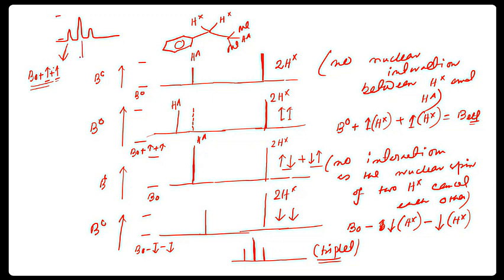And the second one is only for B0, as the nearby two proton nuclear magnetic fields cancel each other. So basically it's the same splitting as B0. And this one arises from B0 minus 2 times the magnetic field. That is the lowest one. Here the splitting is very low. That's the more fundamental description of the triplet peak.